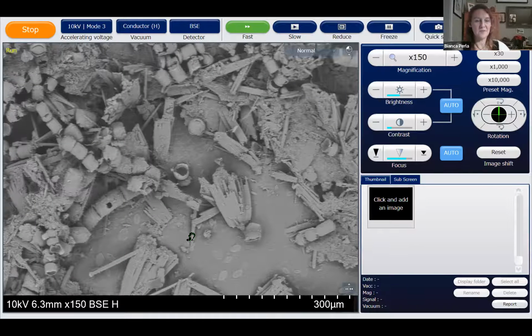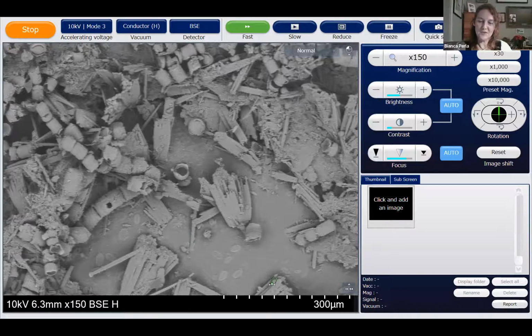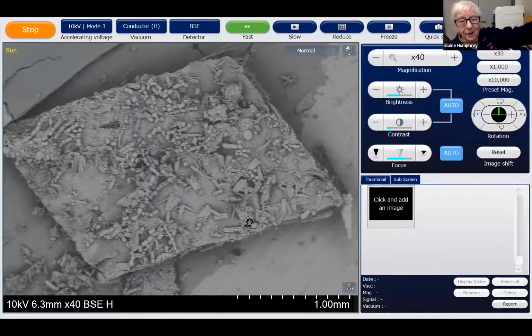And the reason to clean them is to be able to classify them into different species, right? Because you can't see the underneath structure. You can't see the holes. So the slit, it's called a raphe slit, R-A-P-H-E, where the mucilage comes out. How that is arranged with the holes, the pattern, tells you the species. And a species can look the same, except one has a raphe slit that's the whole length, and one is split with a space in between. And then another one will have one raphe slit on one side, but not on the other. And other ones have them on both sides. And suddenly species identification becomes a whole new game.